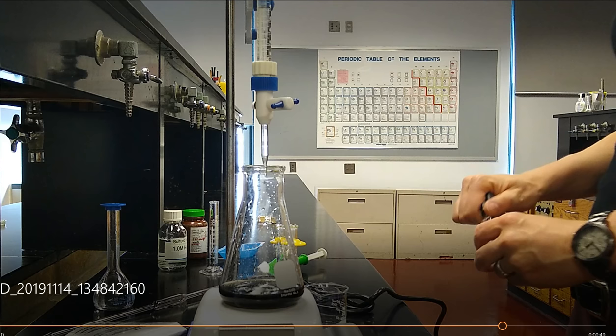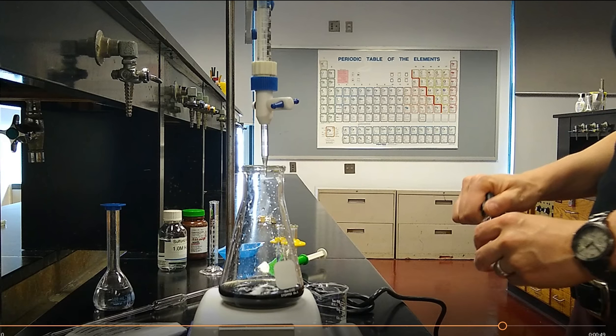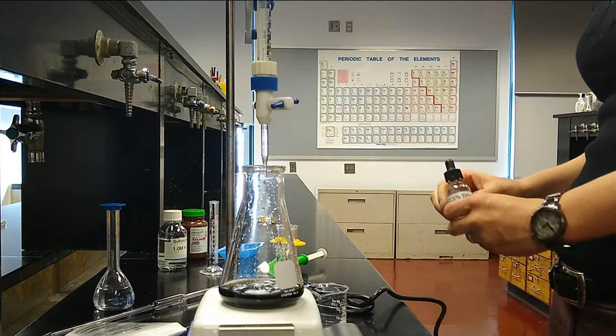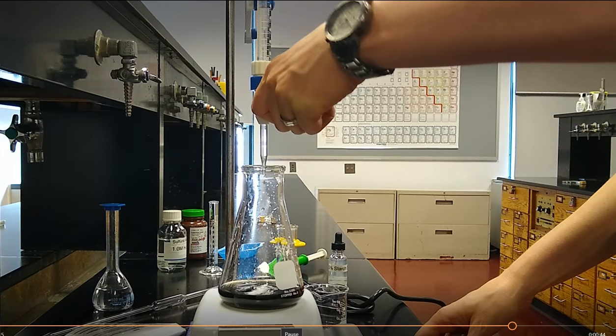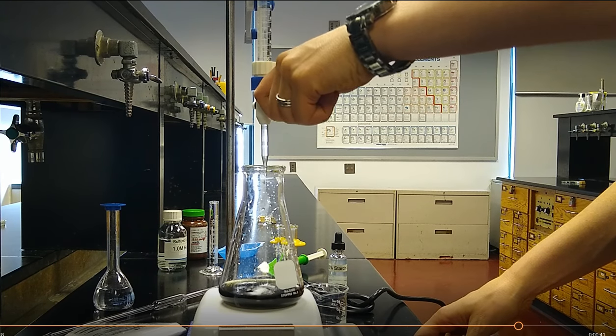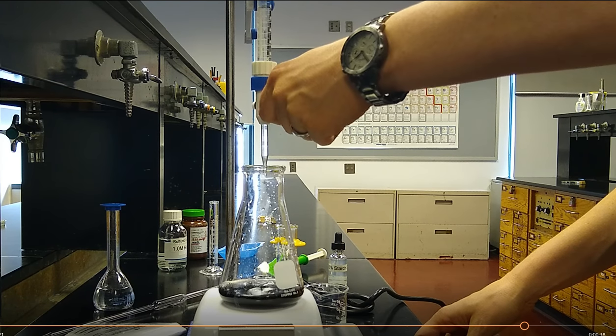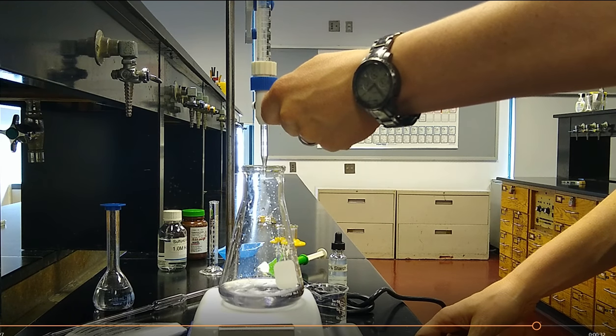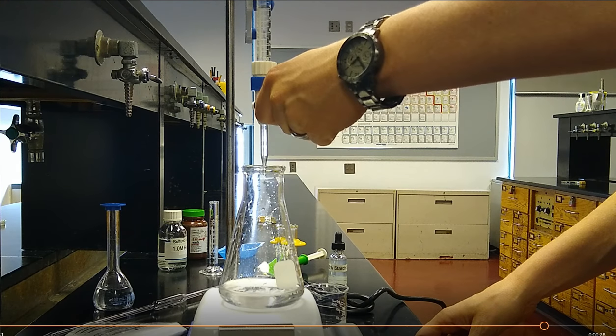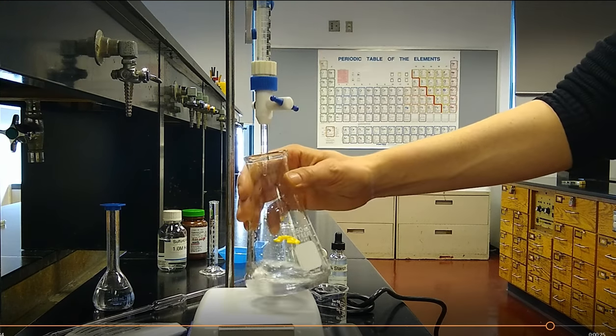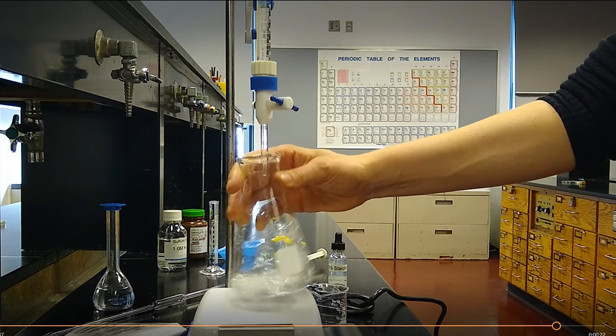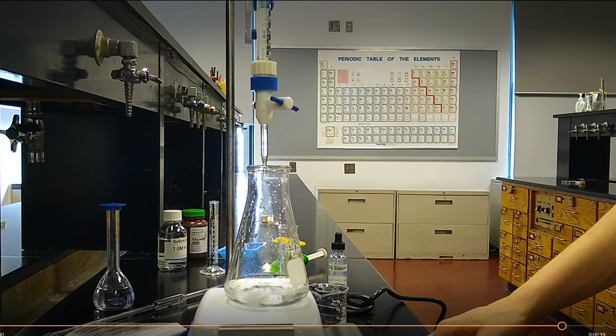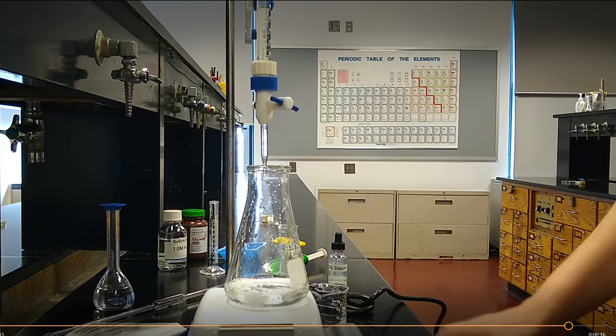We're still looking for that color change to clear, but hopefully now that the solution is black, it's going to be easier to see that change. So over that last arrow, write S2O3 2- as we continue to titrate to our clear endpoint. And you want to be really careful when you get to this point. It is very easy to overshoot or over-titrate. So be patient, add a little, let the stir bar do the work. You might end up having to pick up your Erlenmeyer flask and give it a little bit of a swirl. Nothing wrong with doing that. And once you're confident that it's done, and right now it is, it's not going to get any more clear than that, you're finished with the titration.